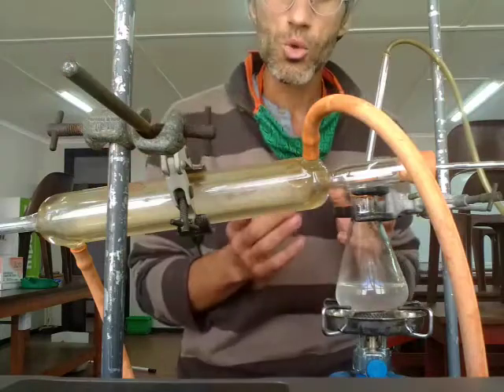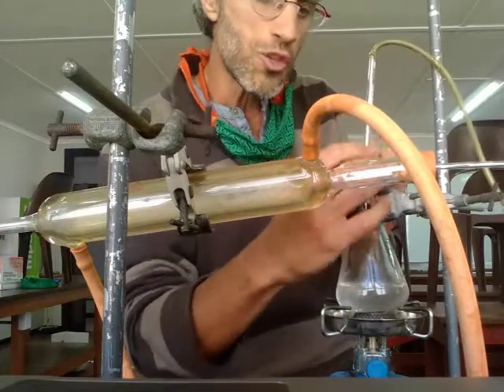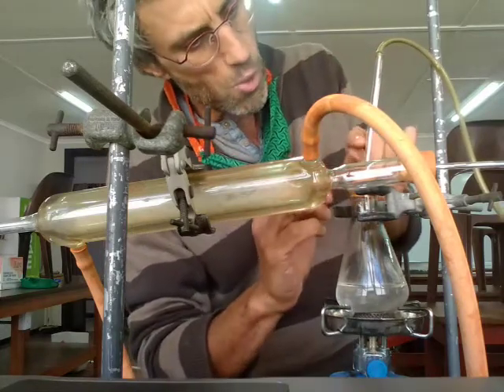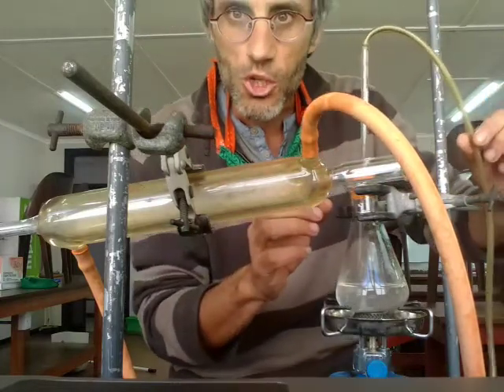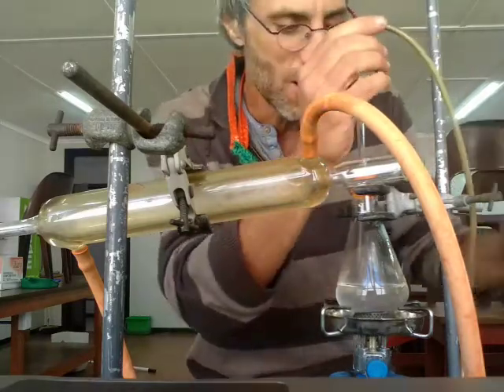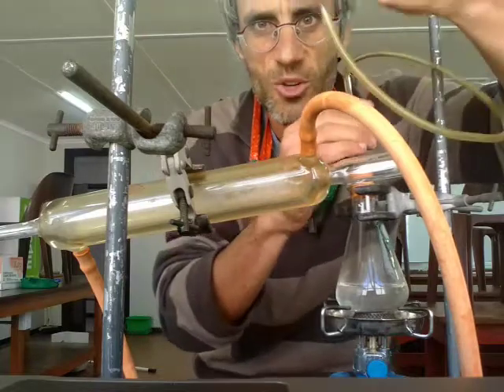So what will happen to the water? It will evaporate. The water vapor will go through this thing, which is called a bung, or a stopper. And the vapor will go through this tube, which is called a delivery tube. The salt, which has a much higher melting point, will stay there. So the salt will remain here. The water vapor, the gas, will go through the delivery tube.